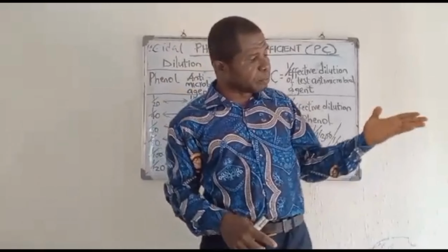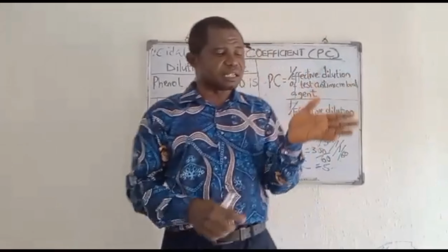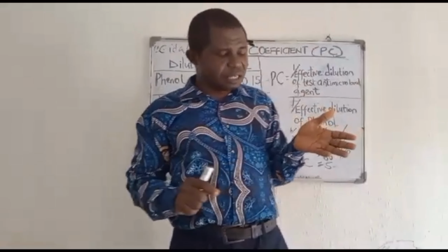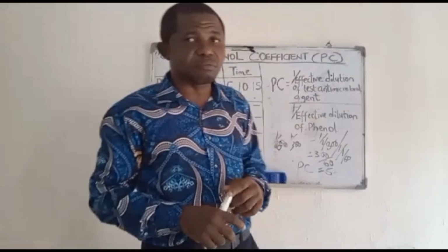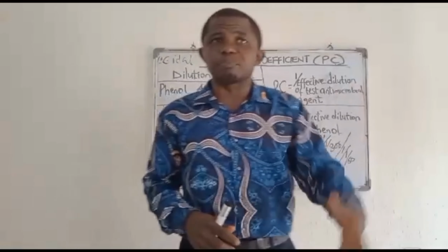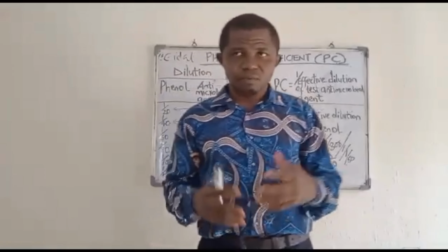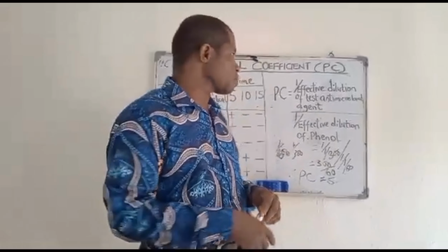That is why in Europe, America and several countries of the world, whenever you buy a disinfectant, you see an inscription, PC. Check that product very well and you will see the PC value on the label, the package label, as the case may be. So that is the advantage of this test. For those of you who want to be entrepreneurs in the future, it is important you carry out phenol coefficient on your products so that the final consumers can buy and be satisfied with them.